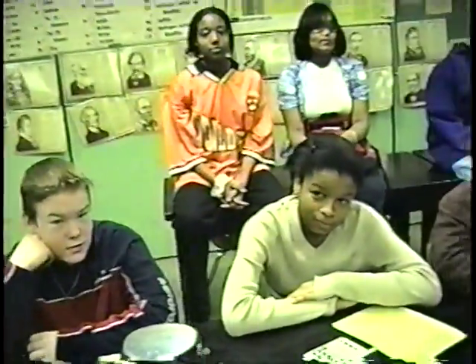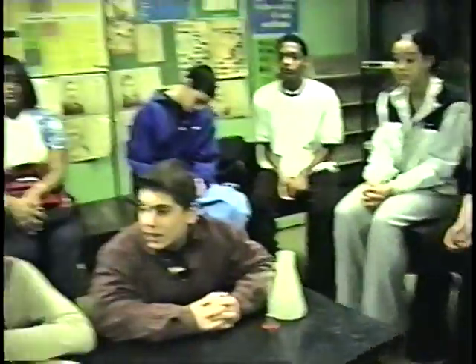Yes, Wilson. Density of a metal. Yes, we want to find the density of a metal. The last time we did a density lab, we were trying to find out the density of a what? Of a wood block. And today we're trying to figure out the density of a metal. It doesn't matter what we're trying to figure out the density of. We have to know two things about the object to figure out its density.